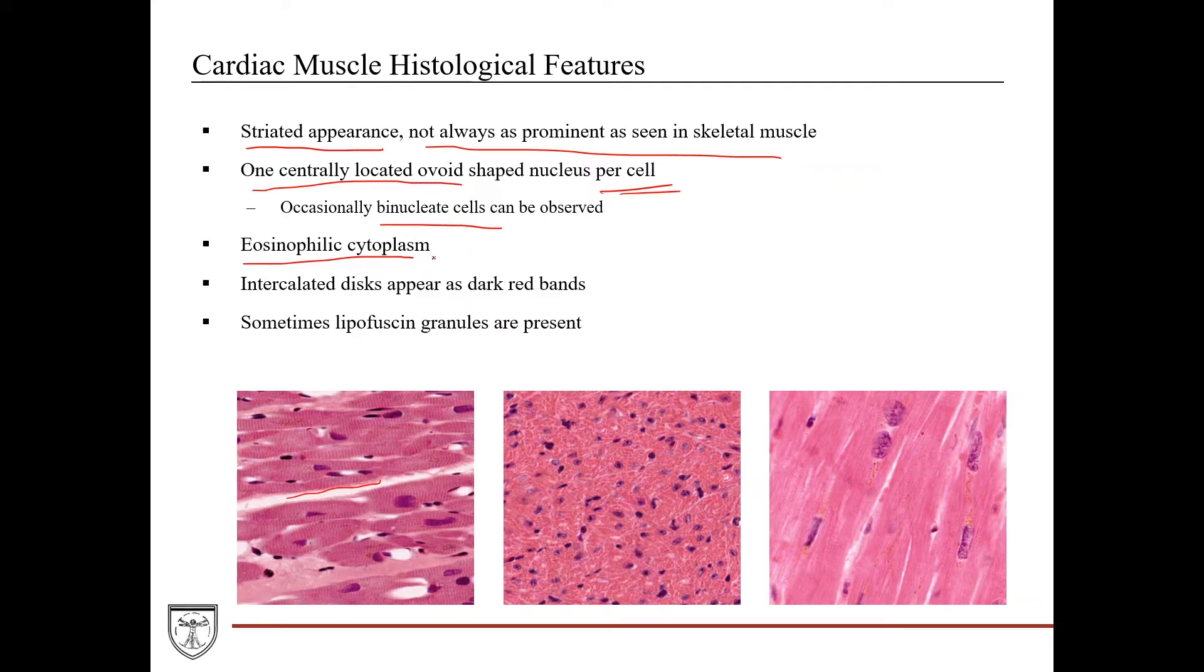Eosinophilic cytoplasm, a lot of mitochondria. The sarcomere has a lot of different proteins involved in the sarcomere structure, so it's going to give you that bright pinkish-reddish appearance. The intercalated discs, they appear as dark red bands because they have that high concentration of protein. You can also see in cardiac muscles sometimes lipofusion granules. These are seen with aging. They're granules that are basically accumulated broken-down lipids and fatty acids. You can see them here. They're kind of goldish, yellowish-shaped like this.